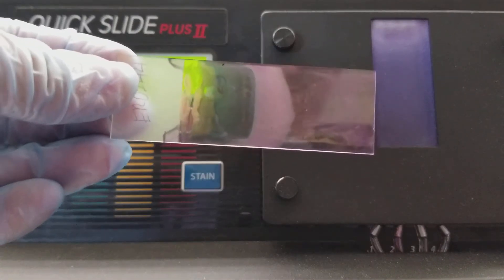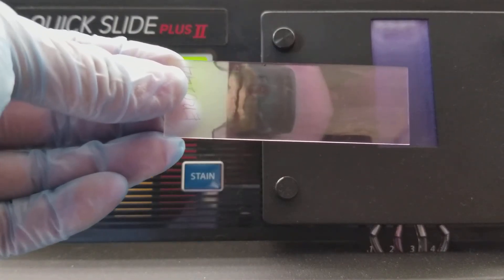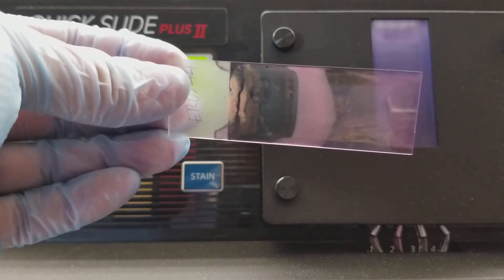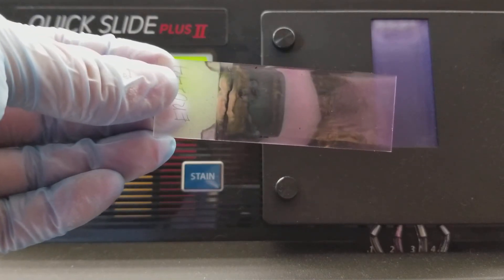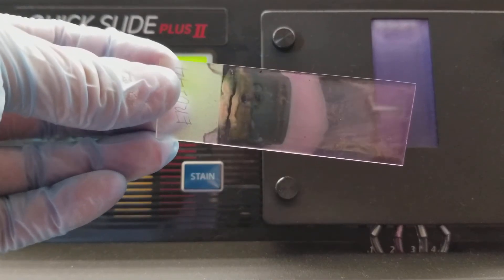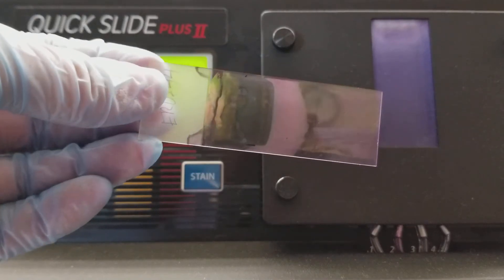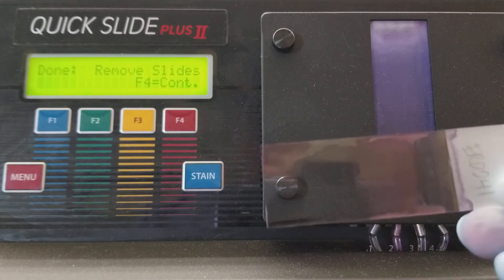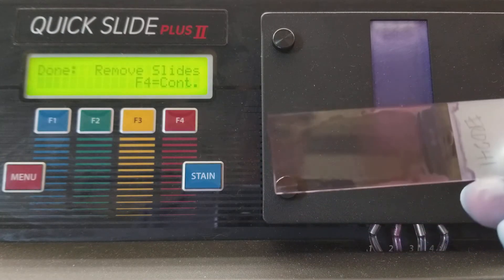There is stain all the way through here, but it is not evenly distributed. So that's going to be a really crazy slide to look at. This one is much better.